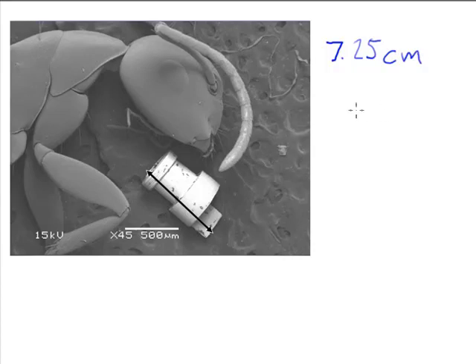Now we go and measure the micron bar or the scale bar down here and see how long that is. Let's say that with our ruler we measure a distance of 4.53 cm.